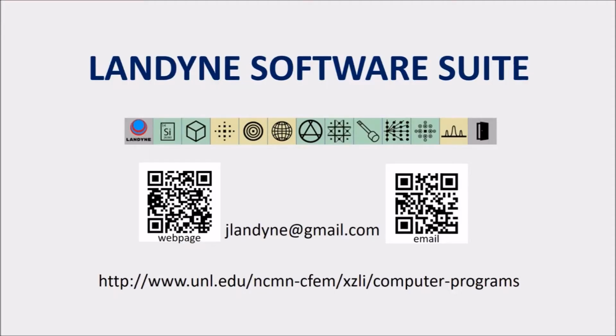In this tutorial video, I will introduce PCED3, a computer software for polycrystalline electron diffraction simulation and phase identification. The current version is 3F. This is one of the main components in the Landyne software suite for electron diffraction simulation and crystallographic analysis. You may download the software suite, including user manuals, from the website on the screen.